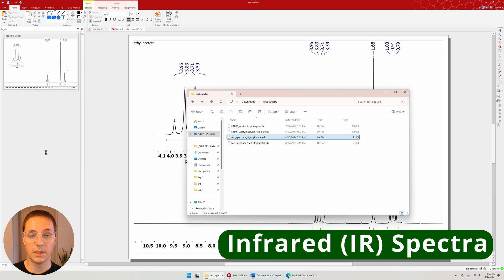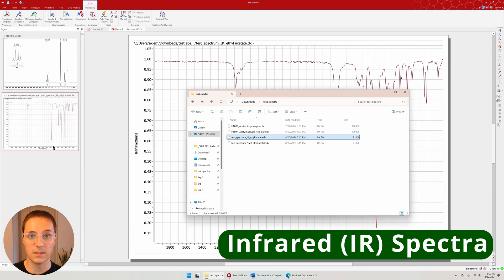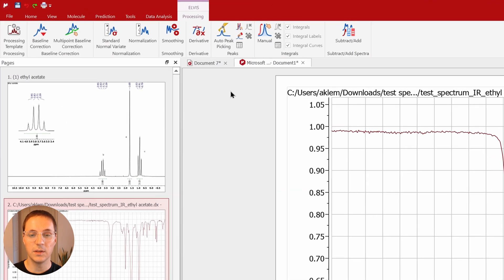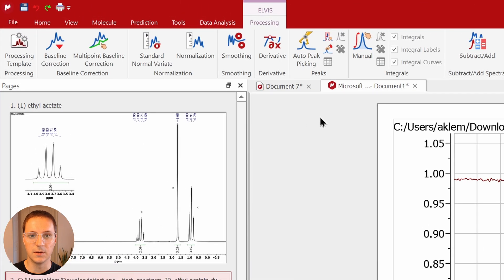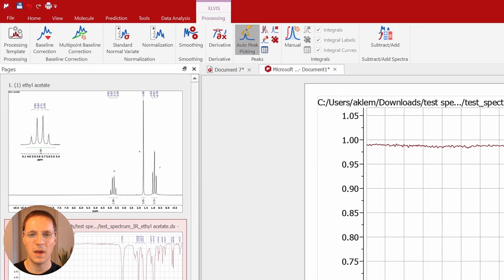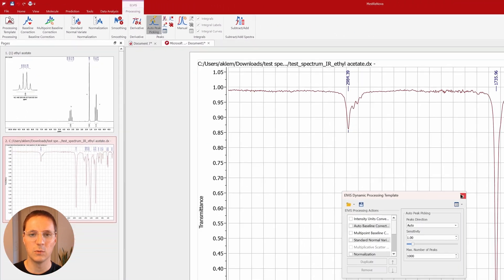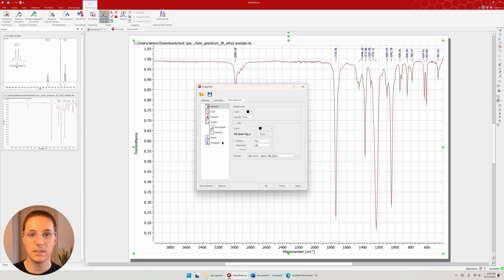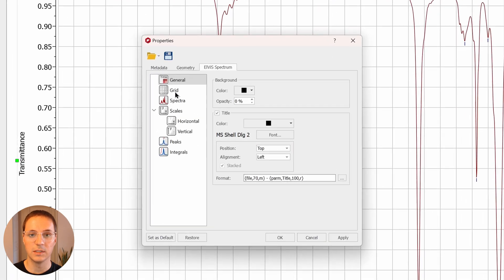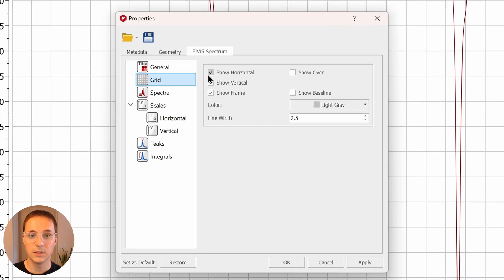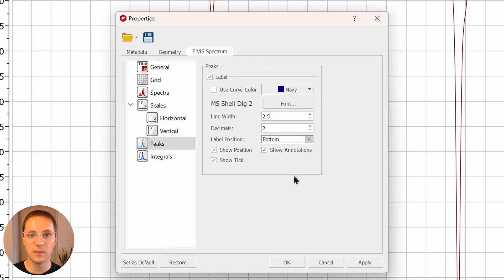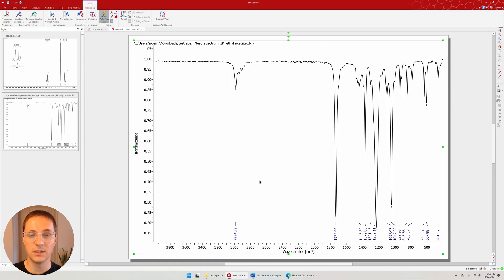Mestronova can also process IR spectra. Typically the only processing you'll need to do for IR is peak picking. The automatic function should work all right. Here you can also adjust the spectrum properties to make it more legible. I like to remove the grid lines, make the peak labels bigger, and change the peak label position to the bottom.